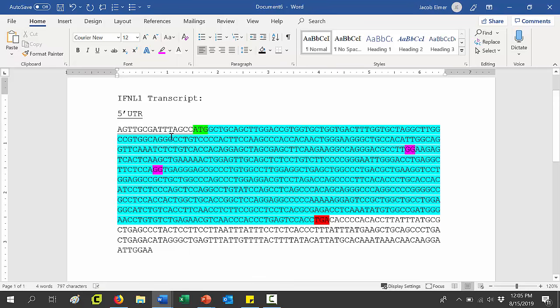All right, and the colors I'm using here are arbitrary. You could make them anything you want, but I'm going to put a gray color there to mark the signal peptide. All right, so I didn't mark all the exons here, but you can get the idea of what this gives us now. We have a very clear picture of the gene, and we know where we should cut with Cas9 to make a loss of function mutation.